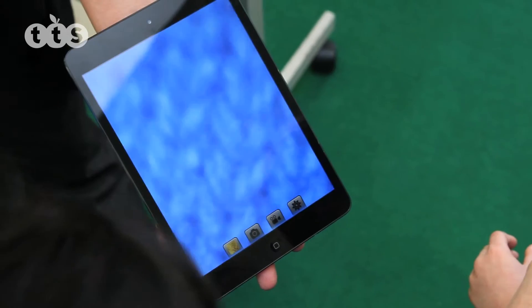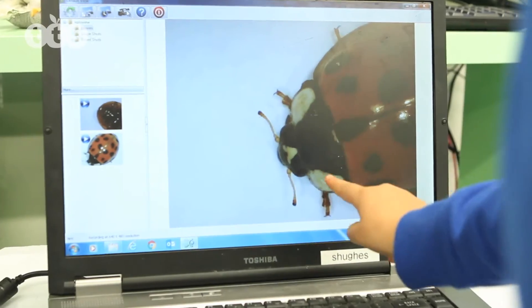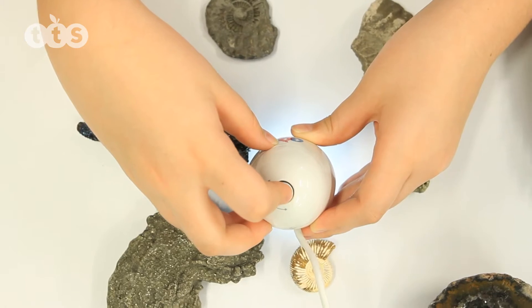A piece of fabric looks like layers of thick woven rope. An insect's compound eye is amazing, and the grains on the surface of a rock sample glitter and sparkle.